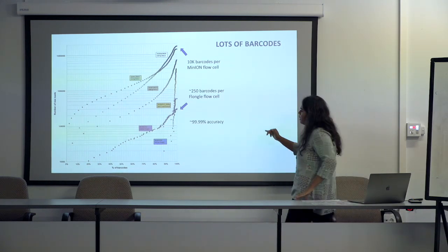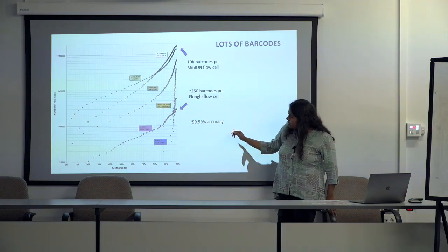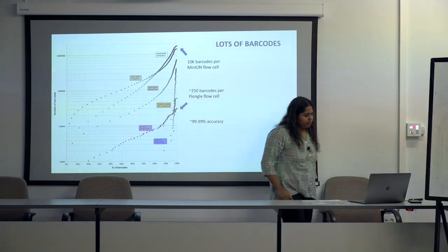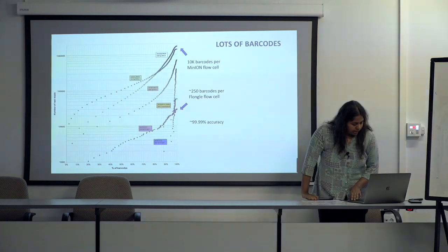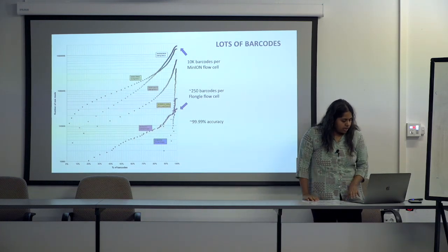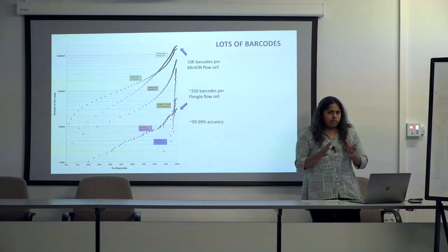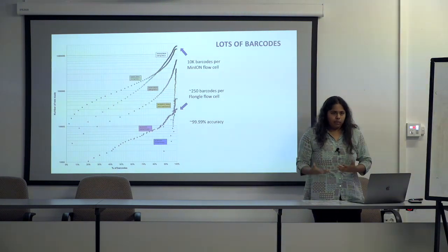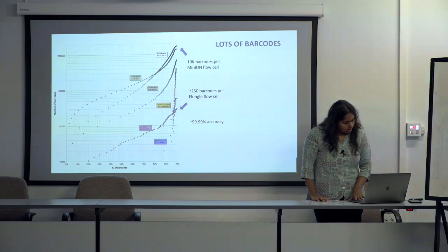At this stage, we could hit about 99.99% accuracies. We resequenced some of the older data sets that we had done previously using the 10.3, and that gave us also references. And these references were generally obtained with either Sanger or Illumina. So it's not within-MinION comparisons.